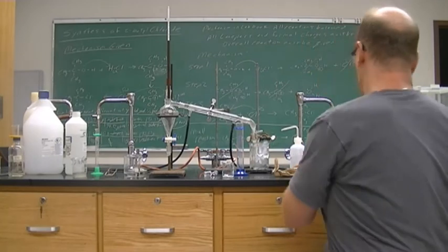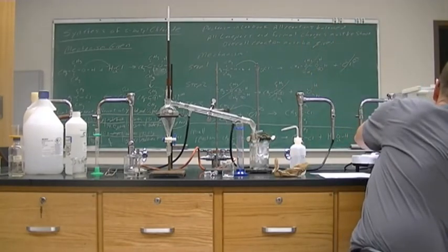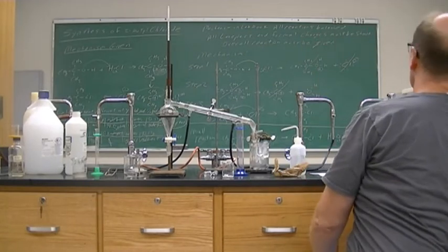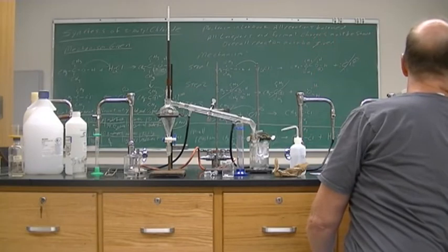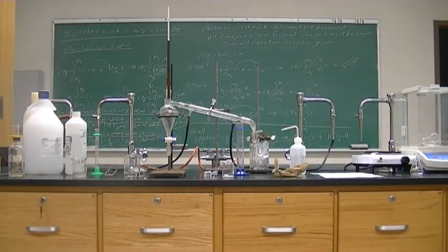All right, so the mass of our product is 1.64 grams.